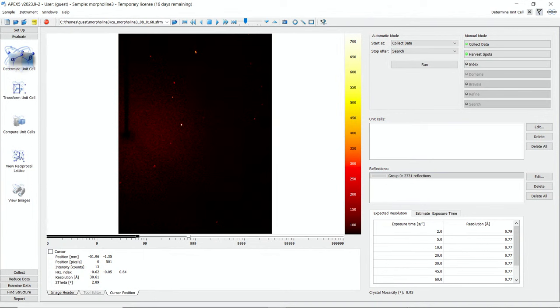What do we do once we get that data? What we see here is that I already started APEX 5. You see the diffraction pattern. I will just play a movie of this diffraction pattern. It was collected on copper. When you look at this, you have a low background and sharp spots. When I saw this first, there's no indication that this is a modulated structure. There's nothing that really scares you right away. We have good separation of spots and good intensity, so I was expecting this would be an easy structure to do.